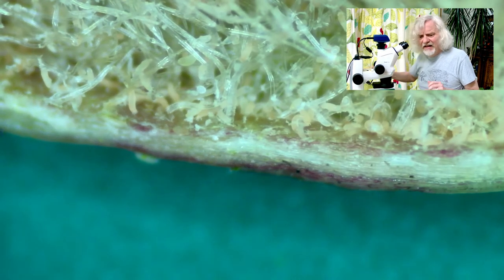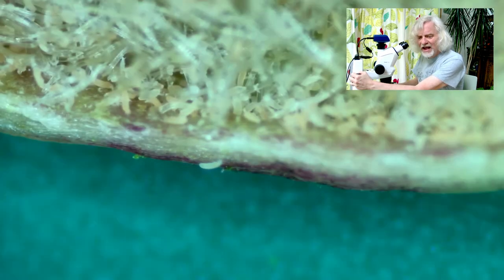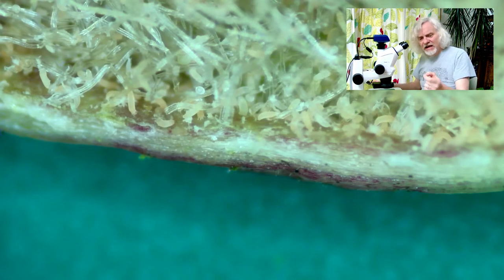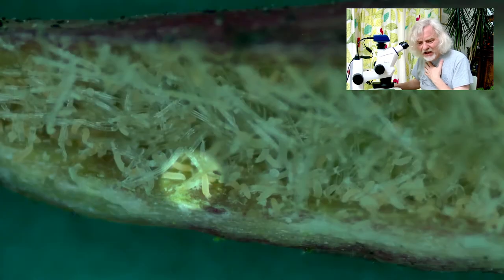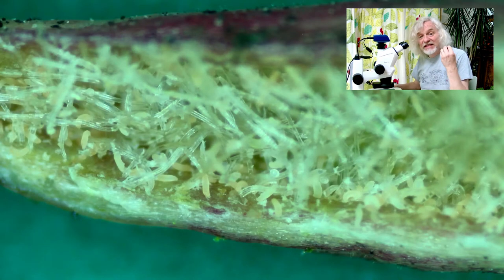And have we got any there? Yes, we have. Now these things are really very small — they are sort of on the limits of what I can show you. And in fact, there's an obvious one right there. Can you see it crawling along? It looks to all intents and purposes like a maggot or something, but it's not. These are actually mites. And if you look, suddenly you begin to see them and it is absolutely teeming with them. Every single one of these little yellowy-white blobs is one of these tiny little mites.